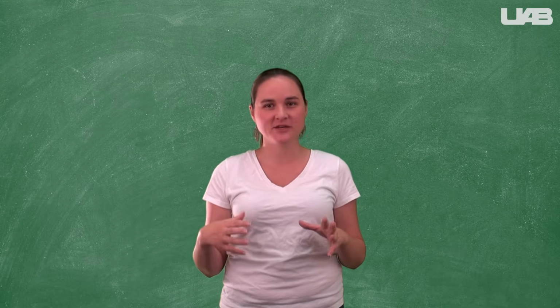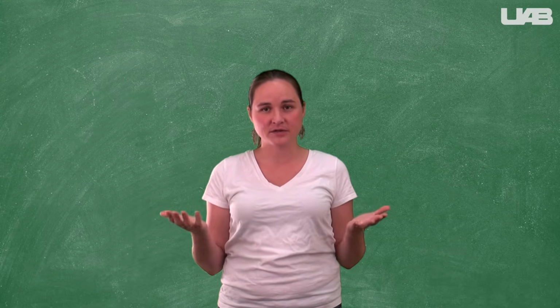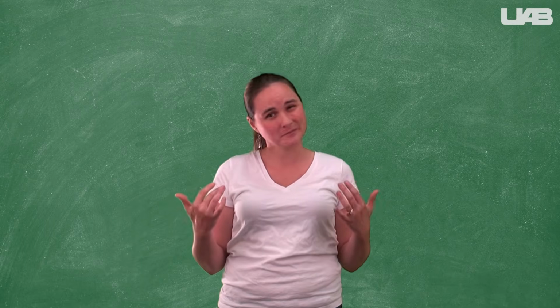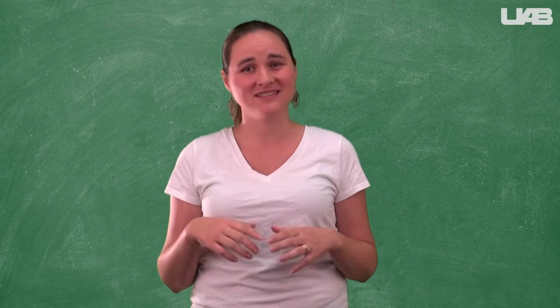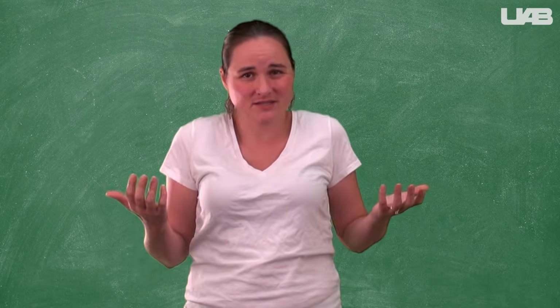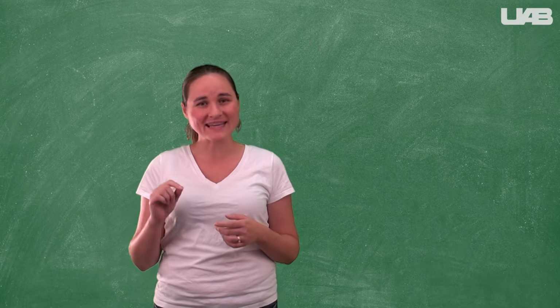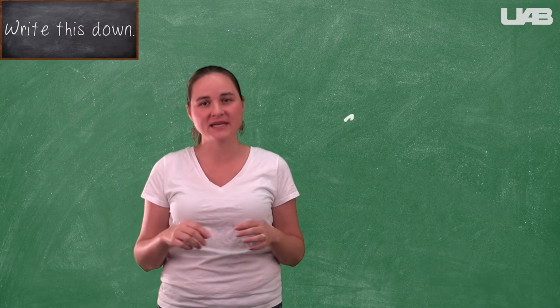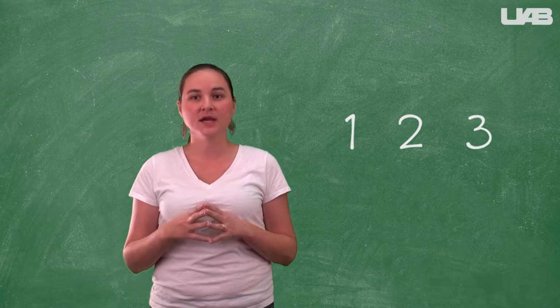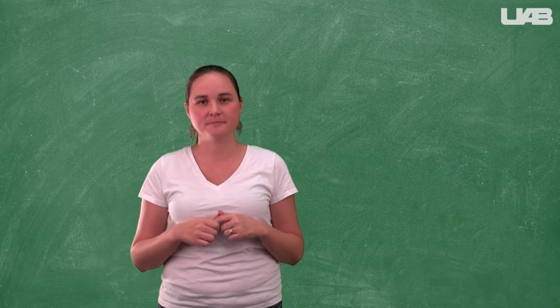Because you have this density equation, all you need to do to find the density is divide mass by its volume, and then you're done, right? Well, actually, that's not the best way to do this. What if you made a mistake that time and you didn't realize it? You can help minimize the effects of small errors and inconsistencies by always performing at least 3 trials. This will allow you to assess how precise you were when you collected your data.